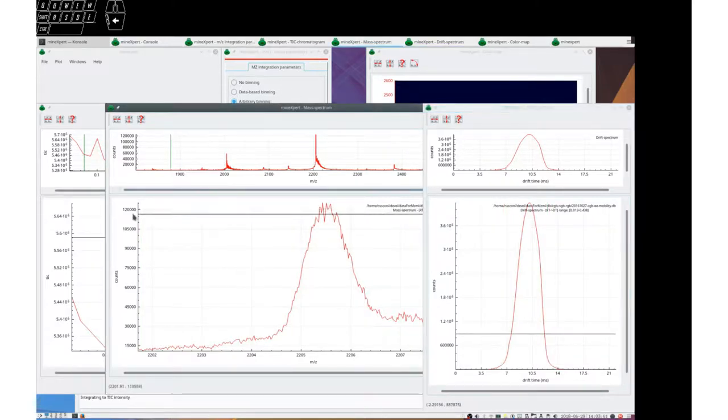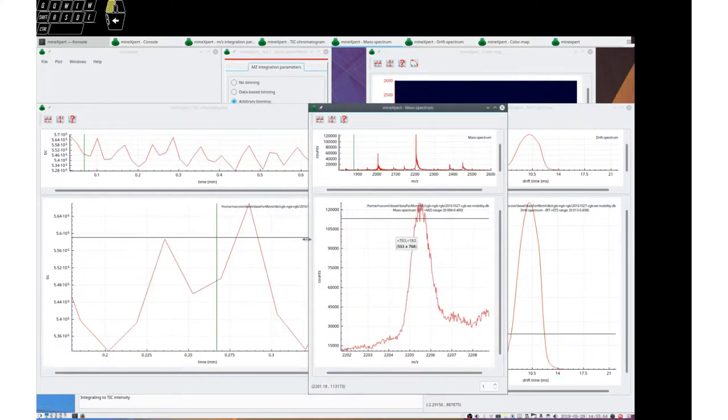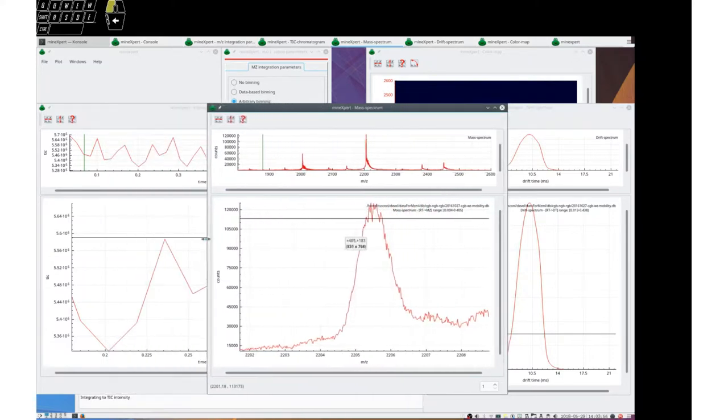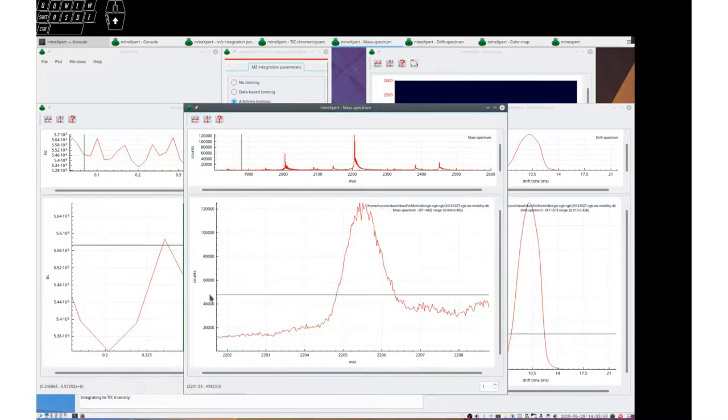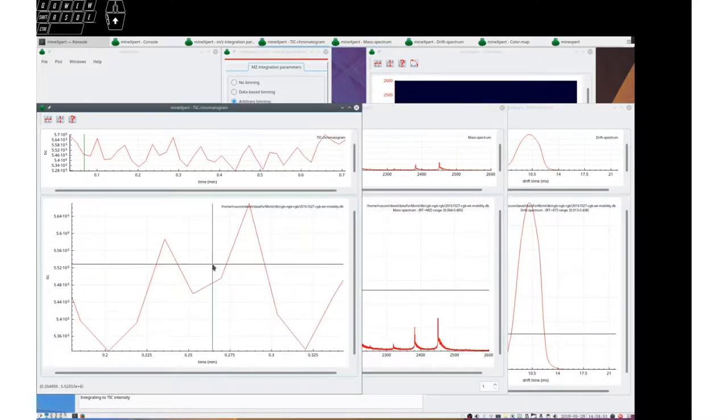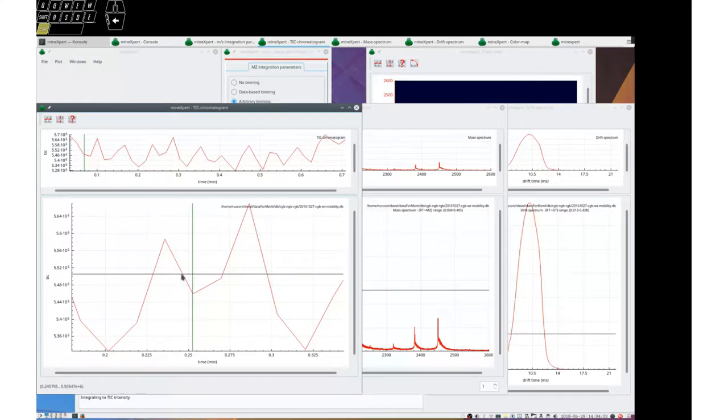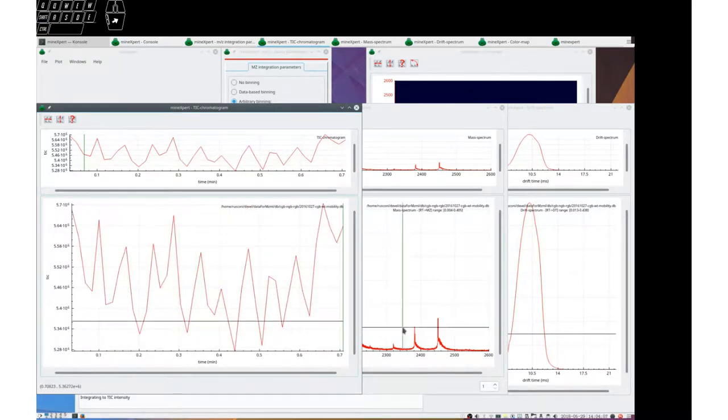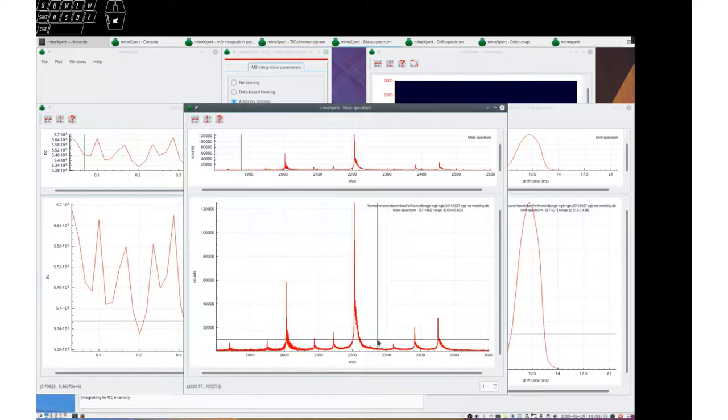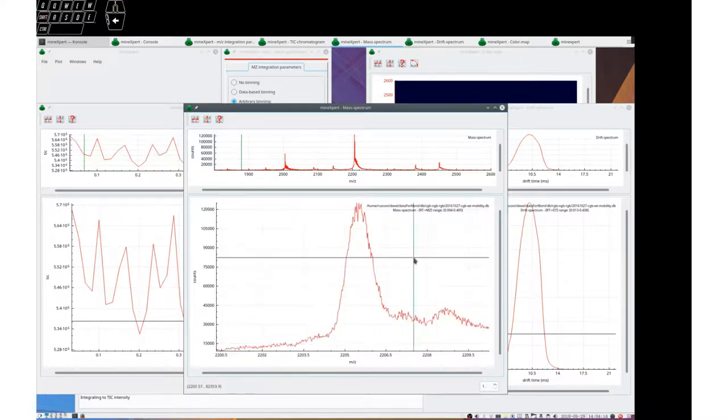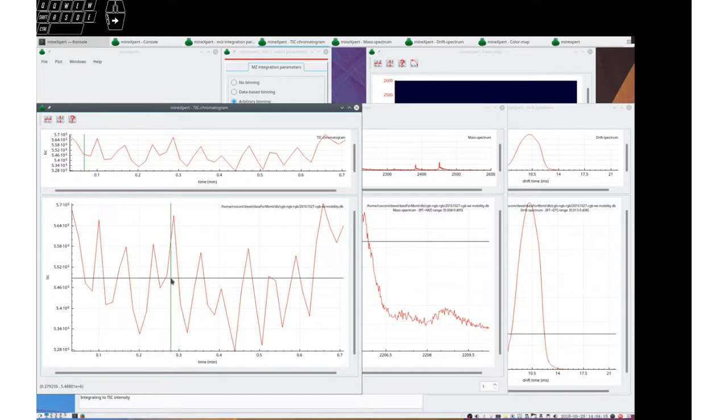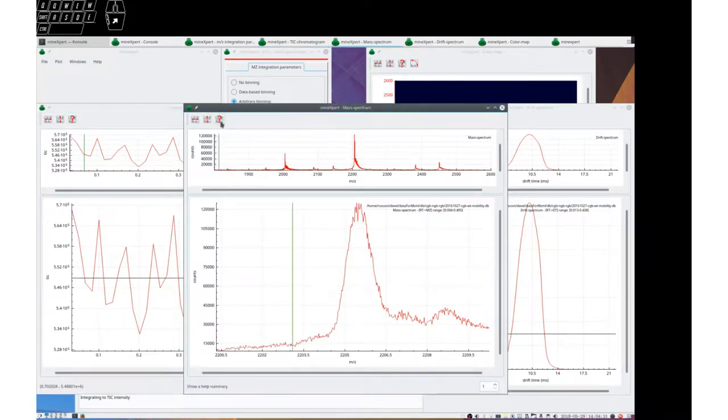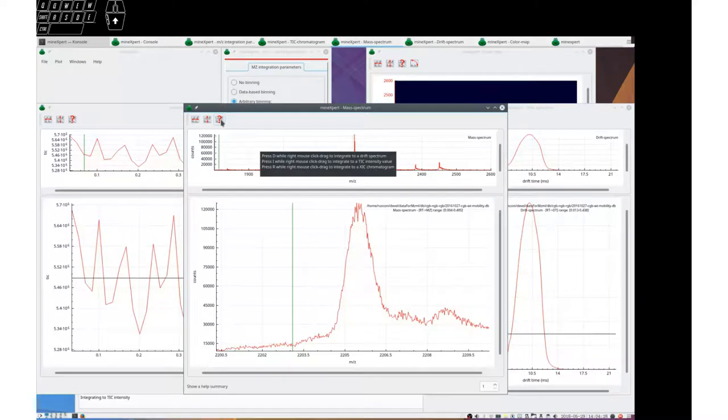It is possible to retro-integrate. We know that this mass spectrum here has been obtained by integrating from the TIC chromatogram. And we now may want to know what is the extracted ion current from this mass spectrum to an XIC chromatogram. The explanations here say that we need to press R while right mouse click dragging to integrate to an XIC chromatogram. Let's do this.